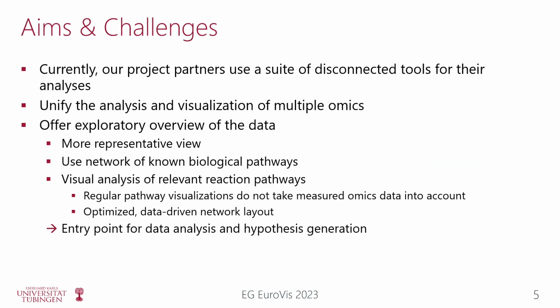With the most important background knowledge out of the way, I now want to outline the starting point of visMOP, pointing out our aims and the challenges we faced at the beginning of the project. Our cooperation partners from the laboratory of the Universitätsklinik Tübingen use a set of distinct programs for each of the omics analyses. This makes integration of results difficult.